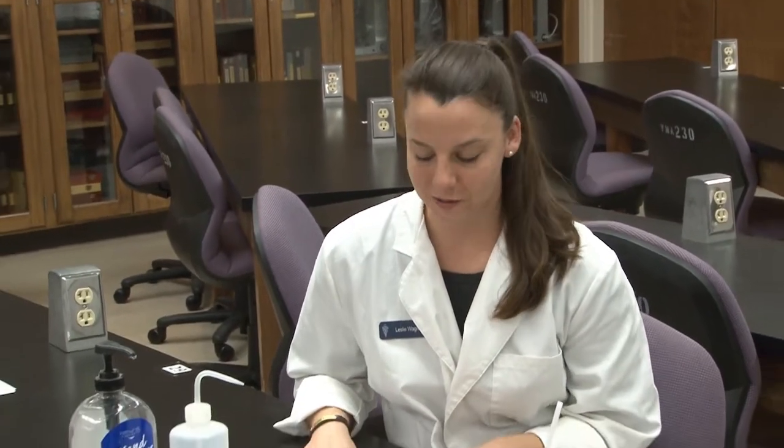Howdy, I'm Leslie Wagner, second year veterinary student here at Texas A&M University, and today I'm going to show you one of the skills you need to know for your FFA veterinary science CDE. Today I'm going to show you how to perform a fecal flotation.